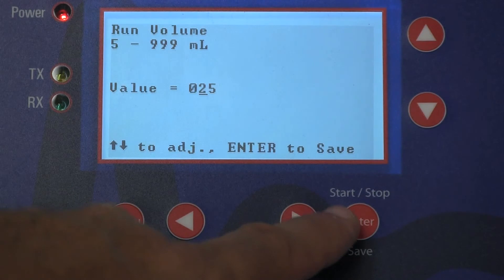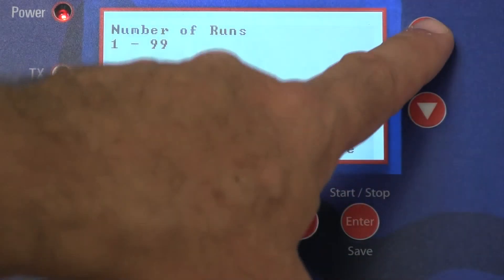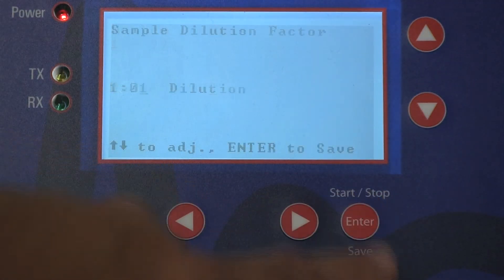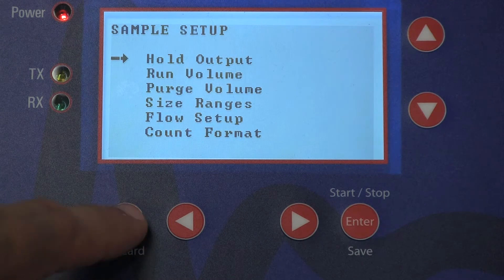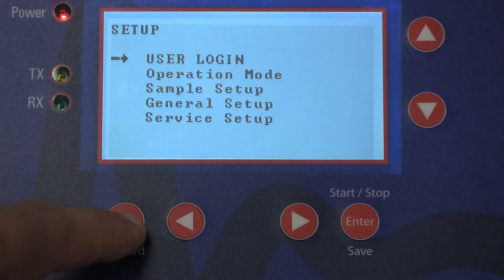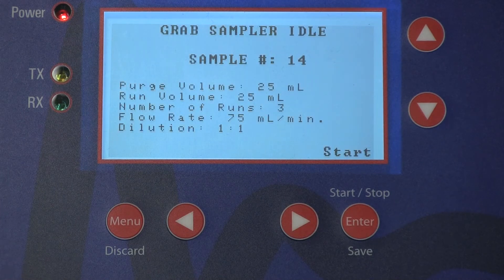The unit can be set up for a single test or for multiple runs of some defined volume. When using the counts per milliliter format, typically sample run volumes of 25 milliliters are sufficient. While when using counts per 100 milliliter format, it's a good idea to use at least a sample volume of 100 milliliters.